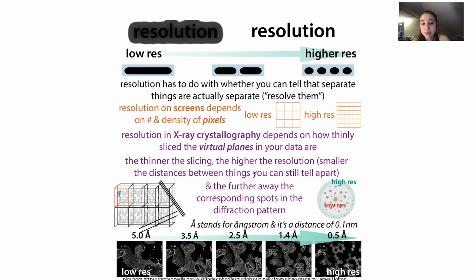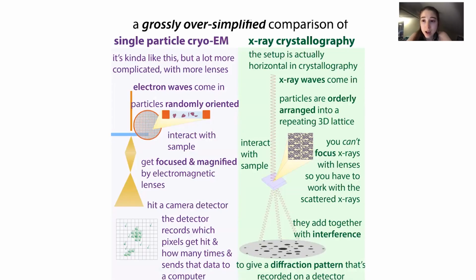And so with the way you set the resolution limit, you're losing information about all of the regions when you don't have the high resolution data. But that doesn't mean that there aren't regions where the data is fuzzier, and there are, and we'll look at that later. Those regions often have what we call a high B factor, which is sometimes called a displacement factor or a temperature factor.